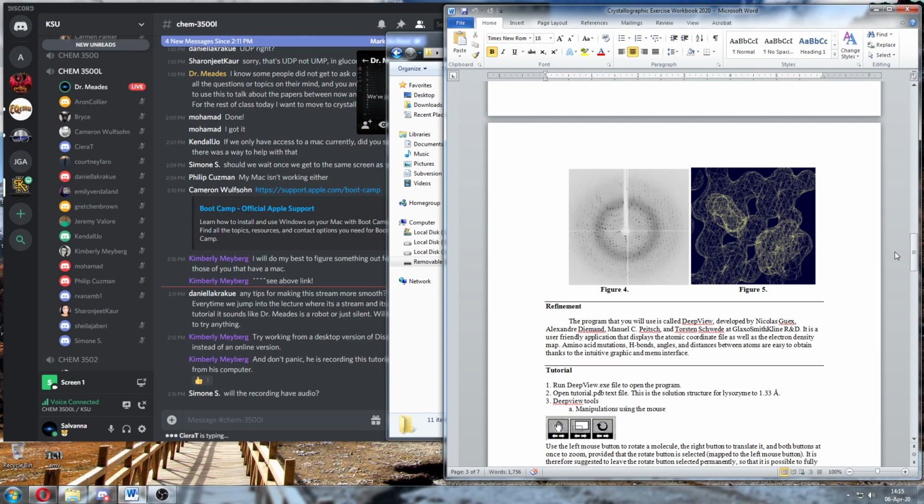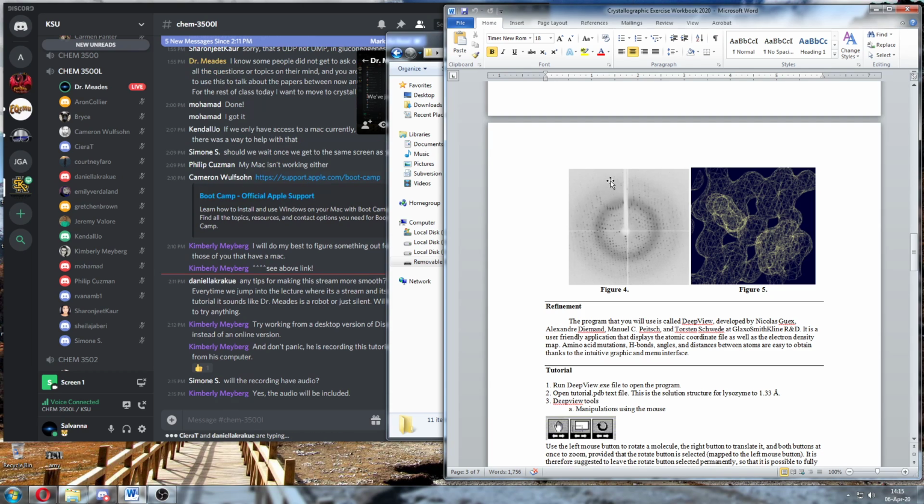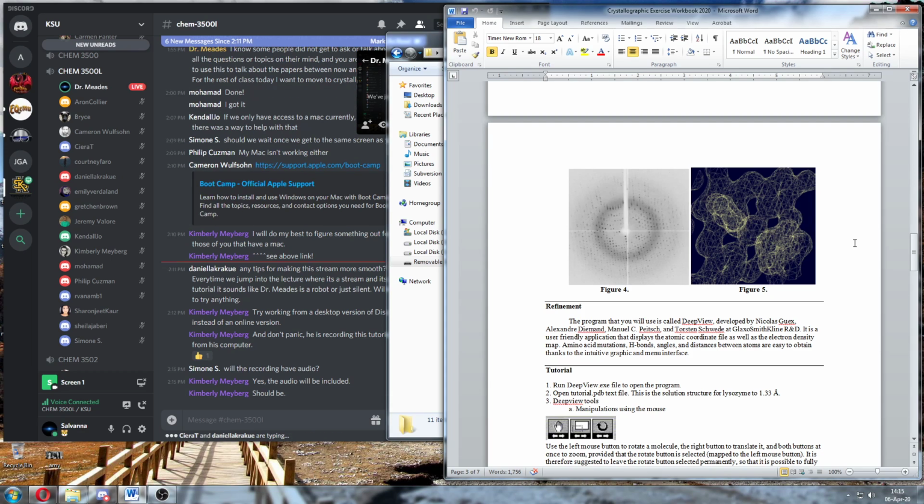So if you look at figure 4, you see there's a bunch of spots. That's where the X-rays interacted productively. And where you see no spot is where they canceled out. And those dark spots in figure 4 aren't just random. You notice they form patterns. There's some concentric rings. So off to the left here is a concentric ring, and then there's more around those. And this pattern of spots tells you something about where the electrons are in relation to each other.